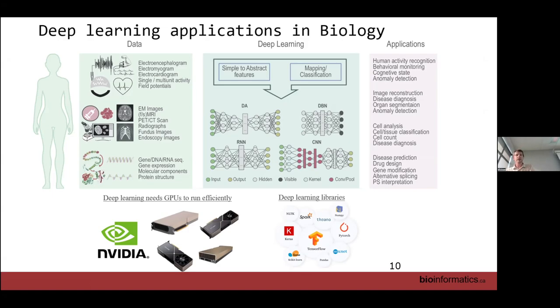For sure, you can imagine a biological field, and you check on Google Scholar, and you will find a deep learning model or a machine learning model that has been trained on the data. It requires, of course, specific materials. You all know about GPUs and the need for this instrumentation, and some expertise with the deep learning libraries.